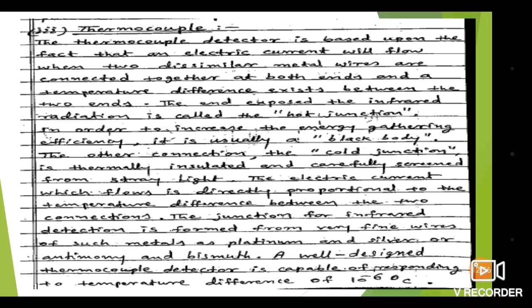So what is a thermocouple? Thermocouple is a thermally dependent detector. Means the thermocouple detector is made up of two dissimilar metal wires connected together at both ends, and a temperature difference exists between the two ends. One is the hot end, and that end is known as the hot junction, which is exposed to the IR radiation.